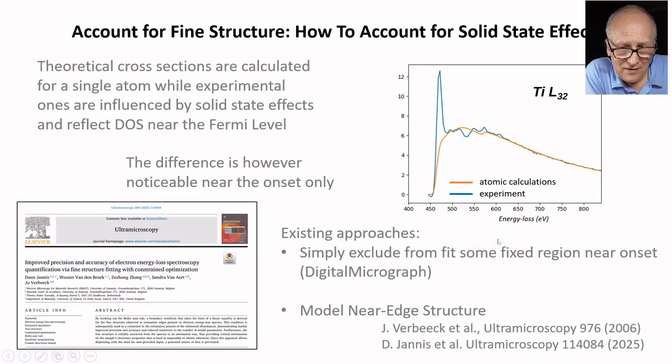Well, there are several approaches to deal with these unpleasant effects, and the simplest one is just to exclude a certain energy region near the edge from the fit, and that is realized in Digital Micrograph, where you can manually vary this exclusion region a little bit and achieve visually the best result.